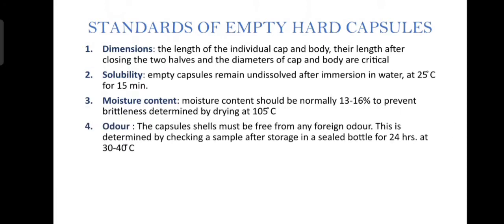Odor. The capsule shell must be free from any foreign odor. This is determined by checking a sample after storing in a sealed bottle for 24 hours at 30 to 40 degrees Celsius.